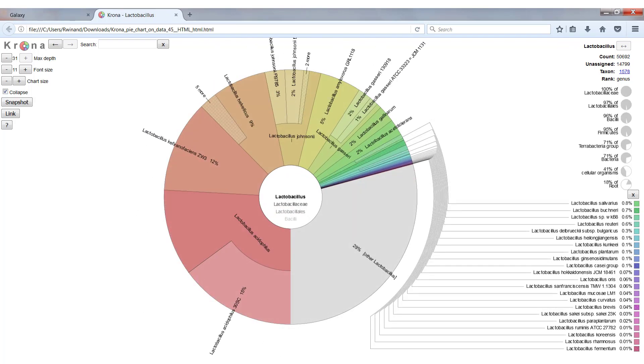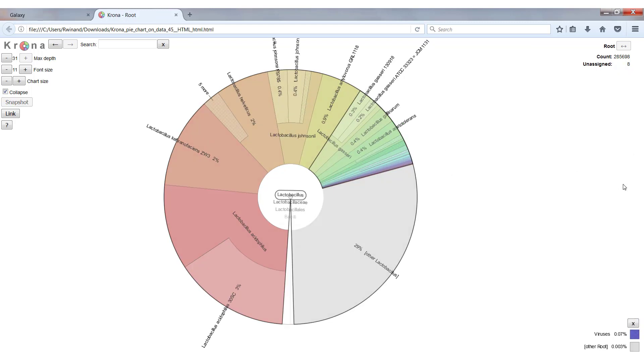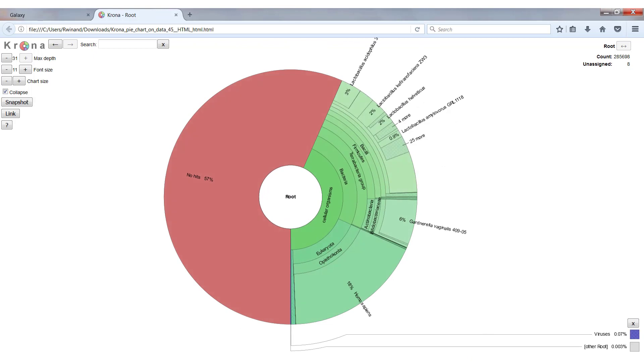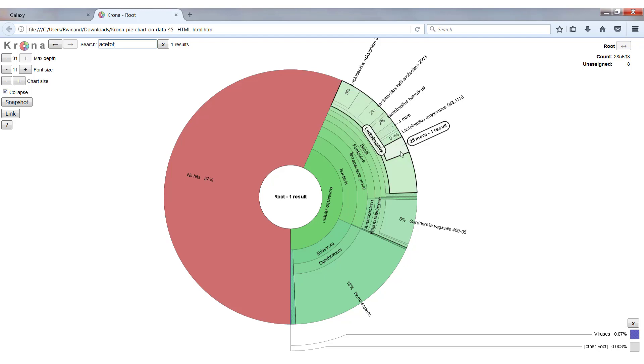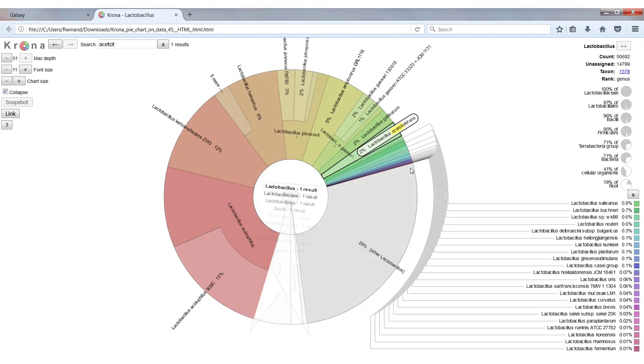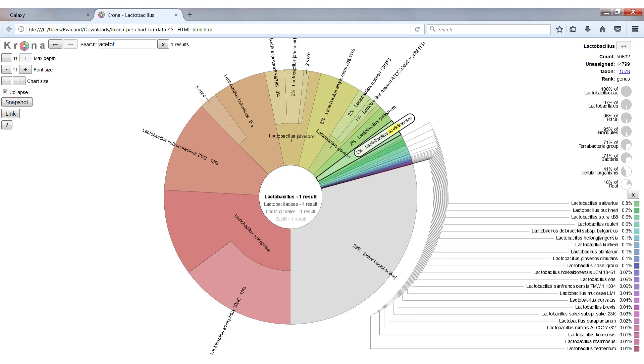You can also zoom out further by clicking on one of the pie charts here on the right. So if you want to go back to the root, we just click on the pie chart of the root, and we will be back where we started. If you know the name of the organism you're interested in, you can also search for it by name. So if for instance we want to look at lactobacillus acetotolerans, we just start typing acetoto, and you will see that there's one result in here. So we click to expand, and we will find lactobacillus acetotolerans over there.